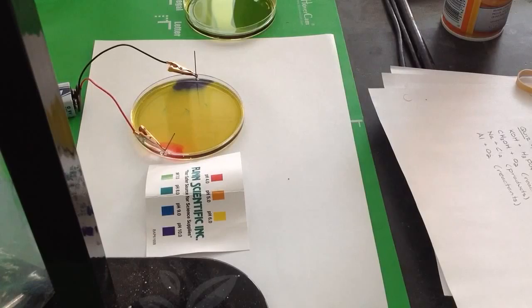If I have water, I have one reactant. What kind of reaction is this? Yes. We are decomposing water with an electric current. But based on the colors you're seeing, what are we making?